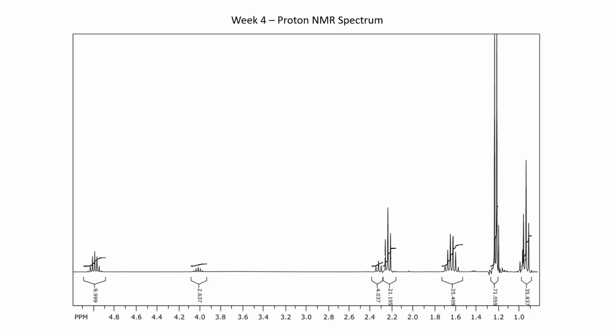All right, here's real student data. Before, when I came to work at home, I copied all of our NMR files onto a thumb drive. I found a free NMR processing program, which I have on my computer. And so I then had to search through tons and tons of data until I found one of Dr. Kwan's sections where they had actually measured a bunch of student unknowns.